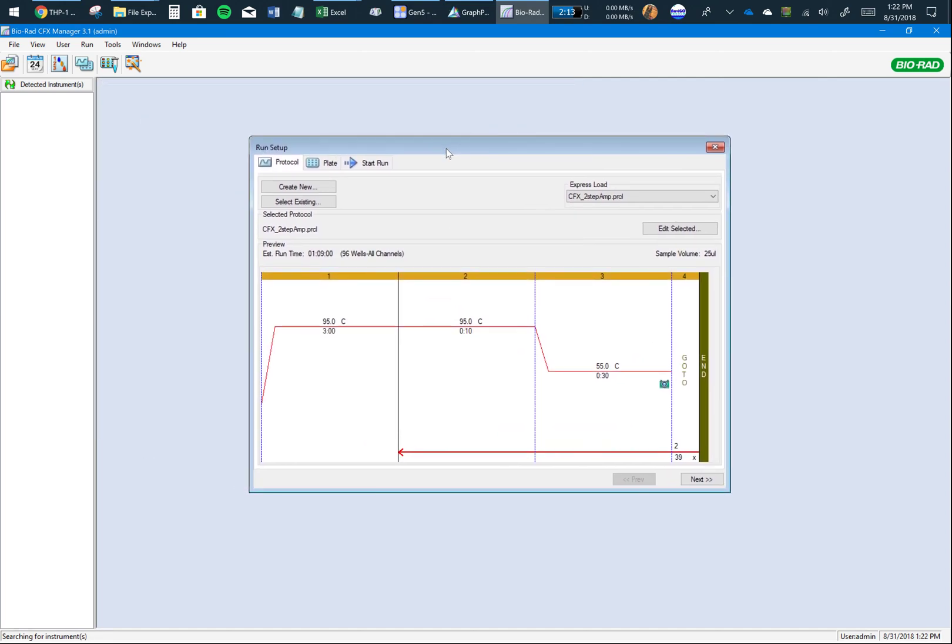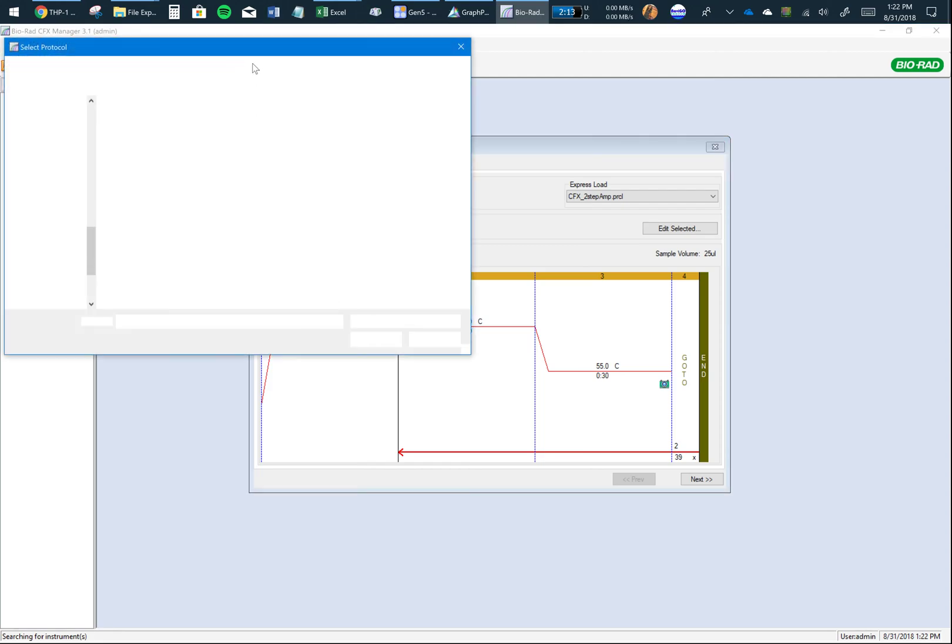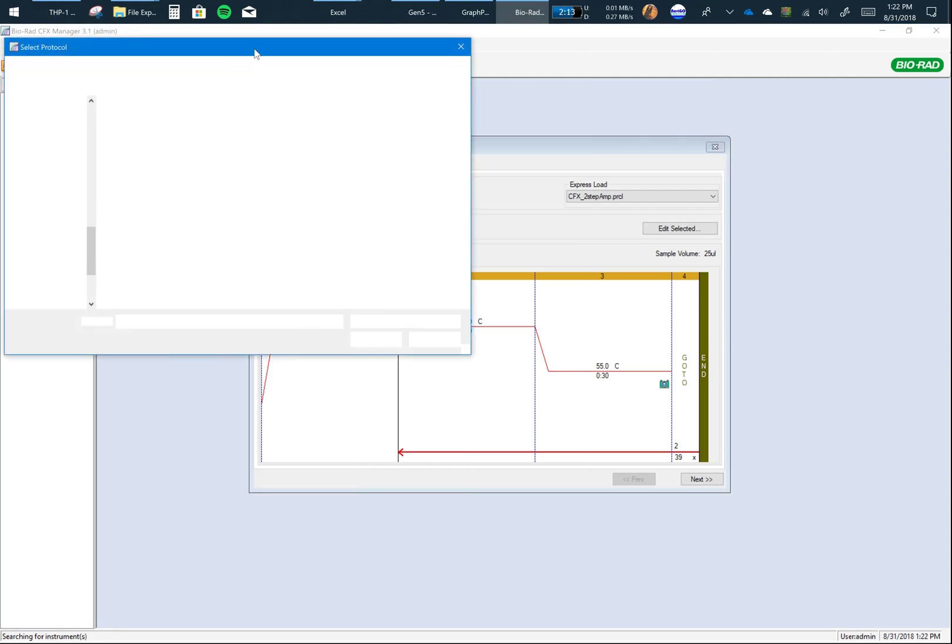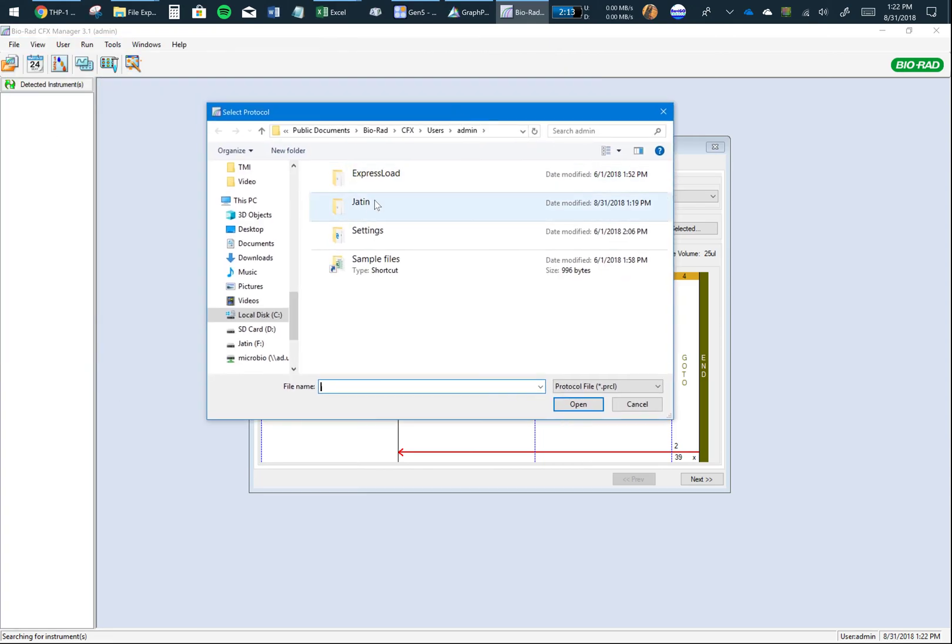About 99% of the time you would already have a protocol made. This protocol is based on the company or the batch of SYBR Green that you're using. In case it's already made, click Select Existing.